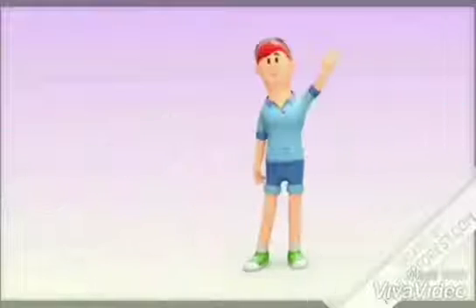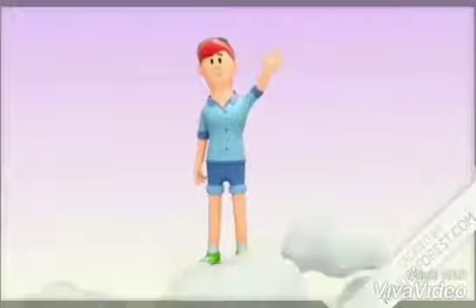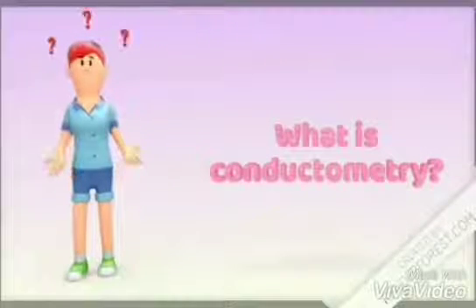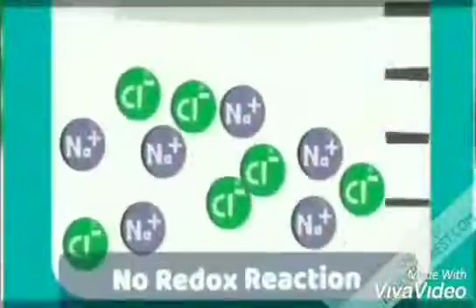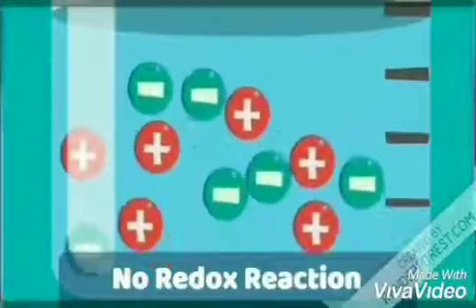Hello everyone, now we are going to talk about conductometry. Conductometry is the measurement of electrical conductivity of a solution. This method mainly depends on Ohm's law. It is the movement of ions in the electrolyte without occurrence of redox reaction on the electrode surface.